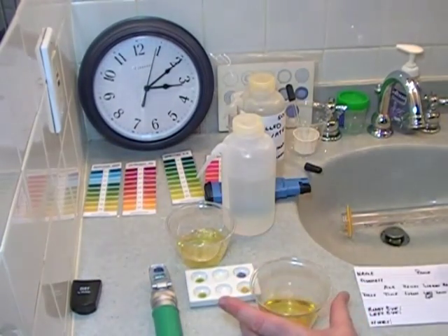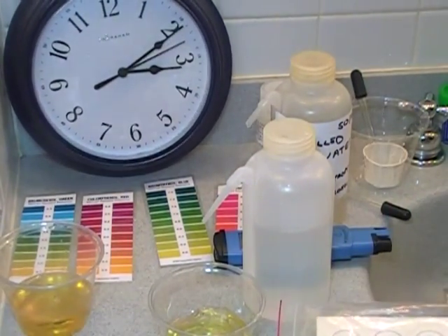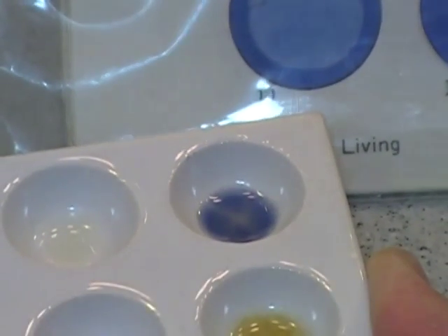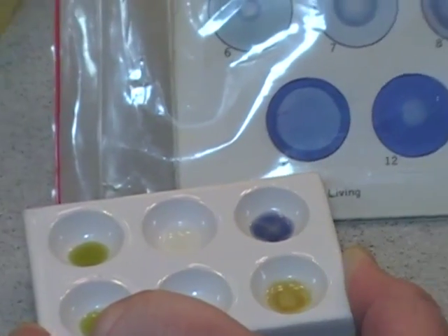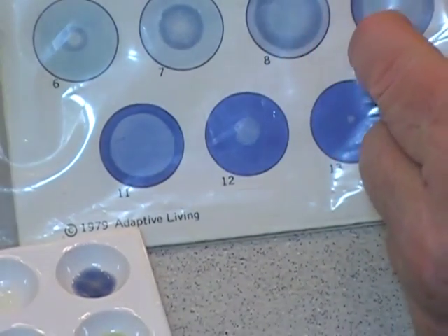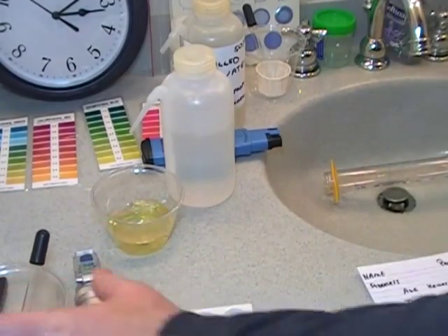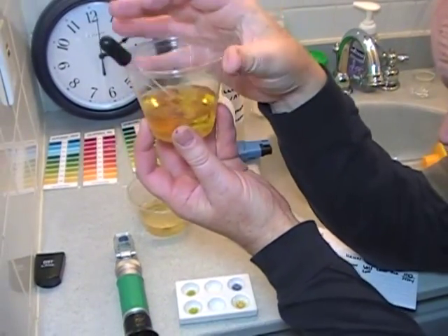We are going to check the albumen — it has been five minutes, so let us look at our urea. The urea, because it has filled the complete plate out but you still see the light ring on the outside, that is an eight. There's still a slight lightness on the outside — this section has darkened up, but it still has a slight blue and is not completely full. So that is an eight. To look at the albumen, give it a little stir and you'll need a flashlight.